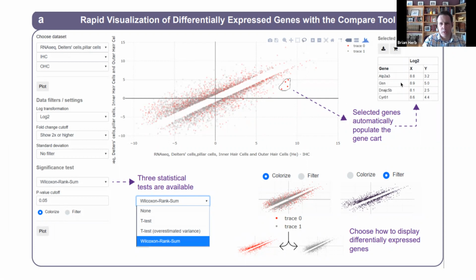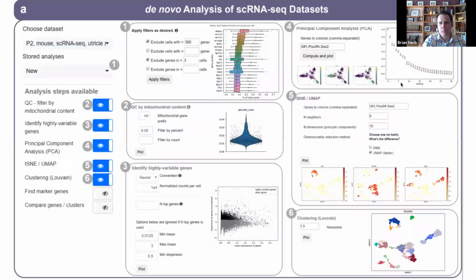So that's one tool that I'm not going to explore too much, but this is the one we'll really get into, the single cell workbench, which uses the ScanPy program as a means of analyzing the data. And the big hope here is that this could be a good gateway for biologists who don't necessarily have the bioinformatics background, who don't want to get into the programming, but want to be able to reanalyze single cell data. We've taken every single step of that processing and presented it as a GUI.